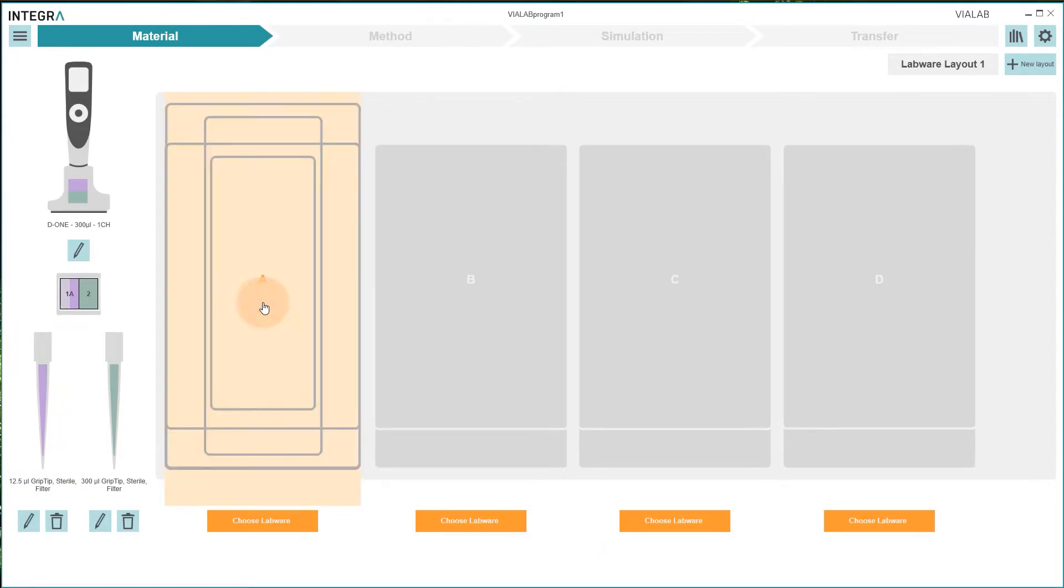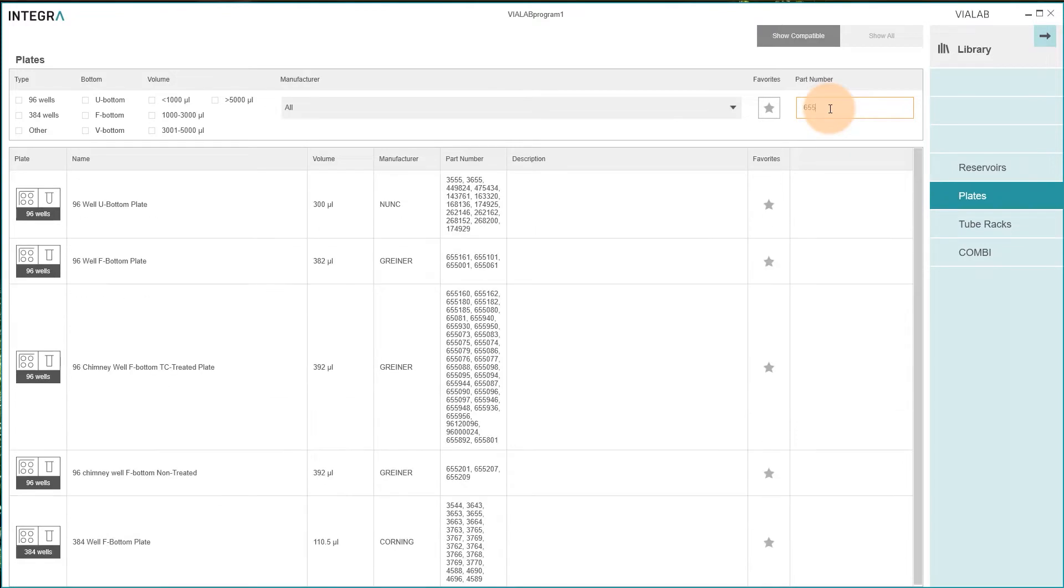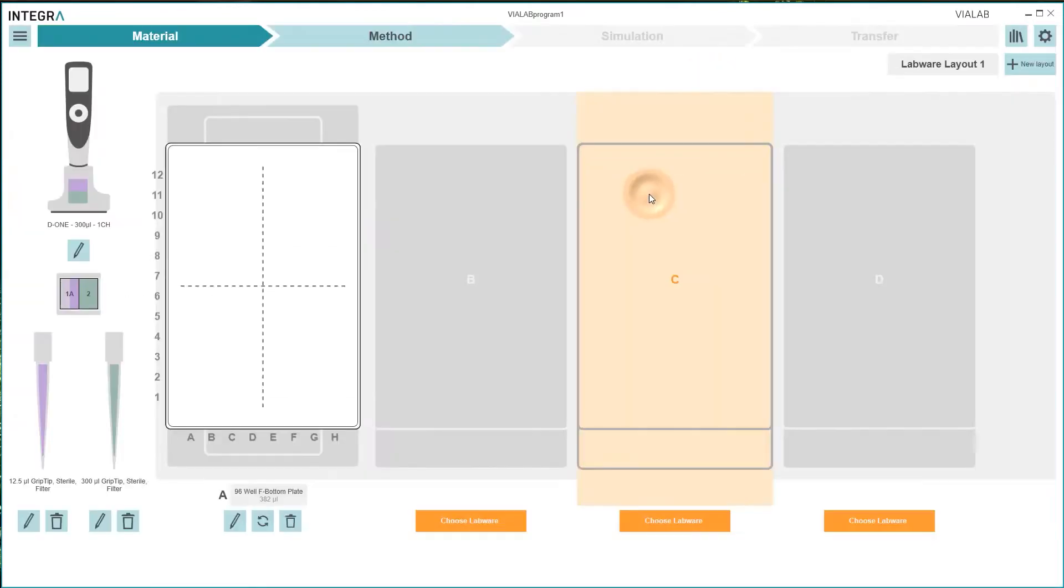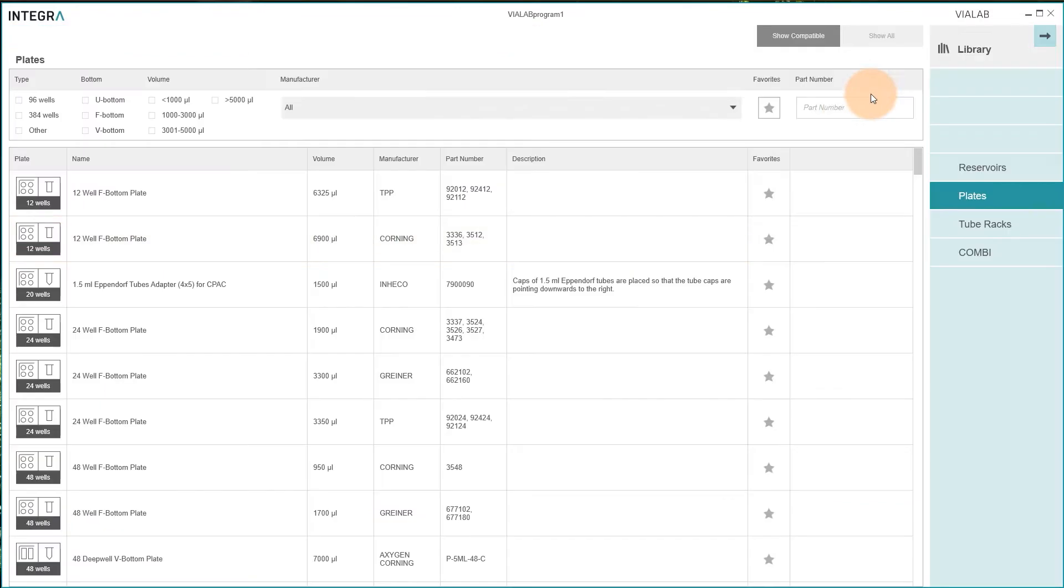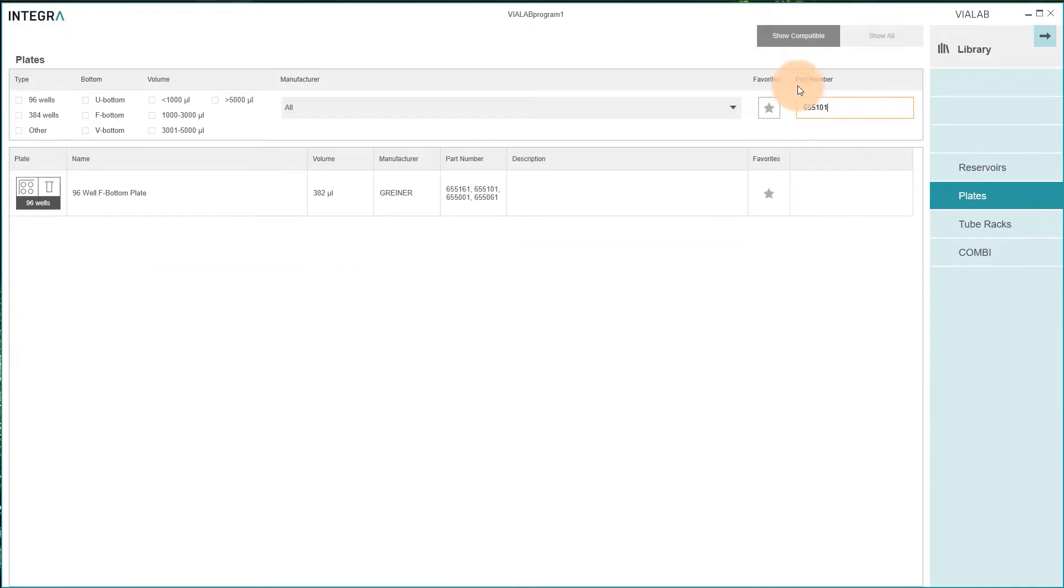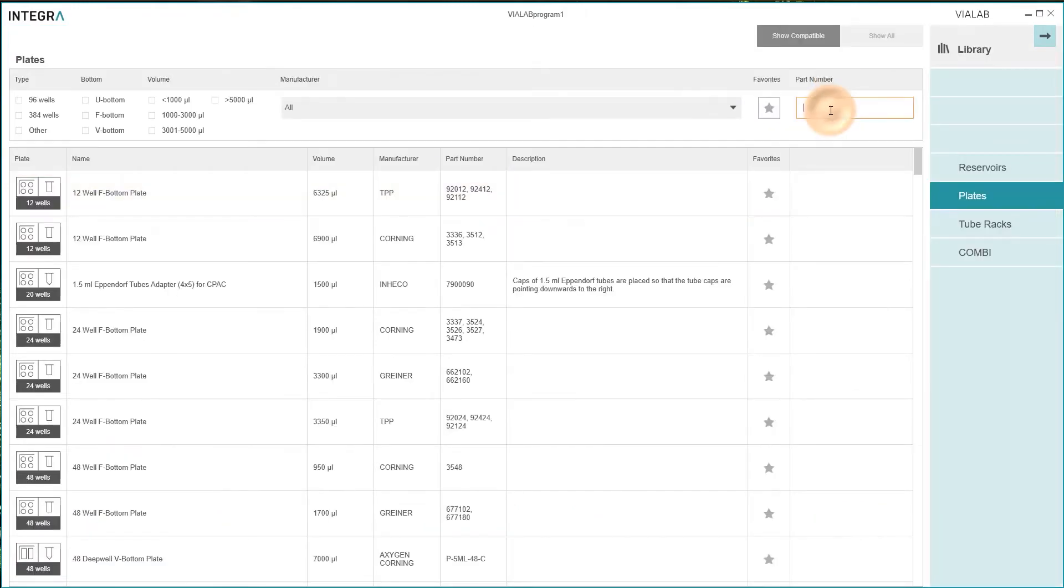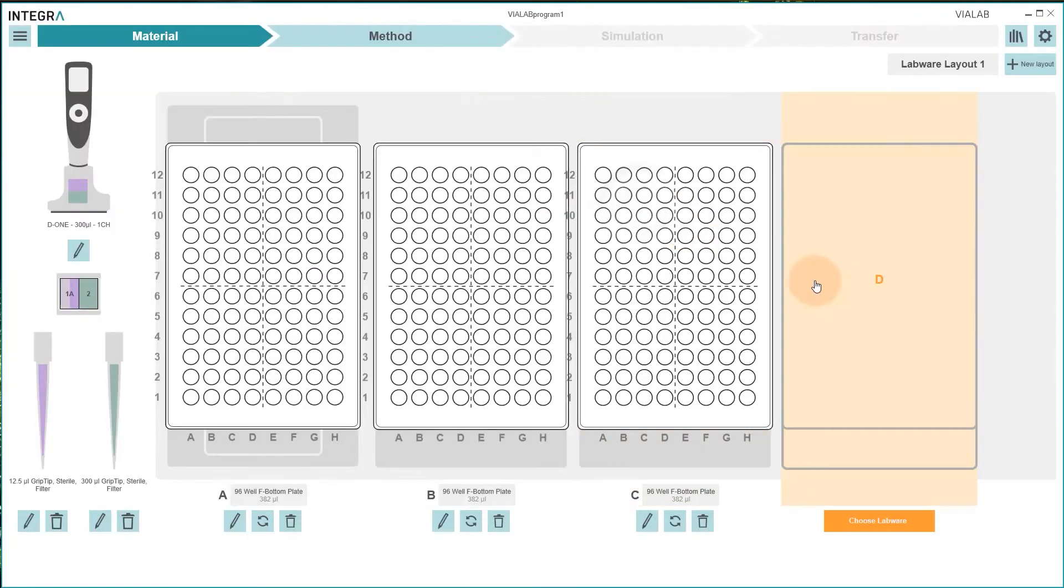Continue with picking the labware. In this example we place three 96 well plates on deck positions A, B and C and one 384 well plate on deck position D. The 96 well plates contain all hits and the 384 well plate serves as a target plate.